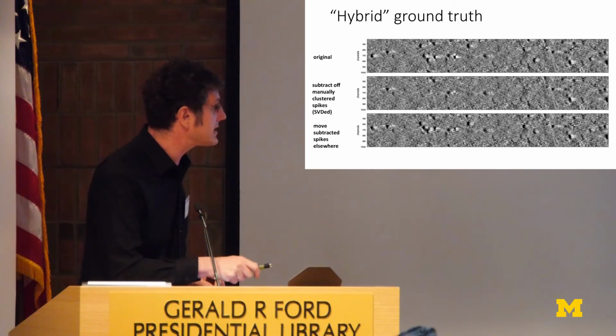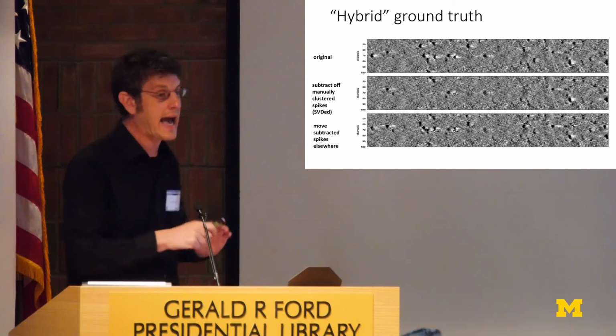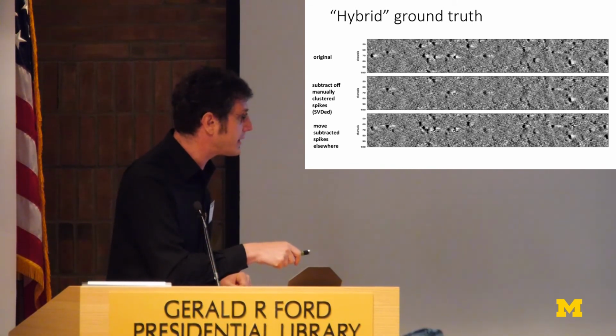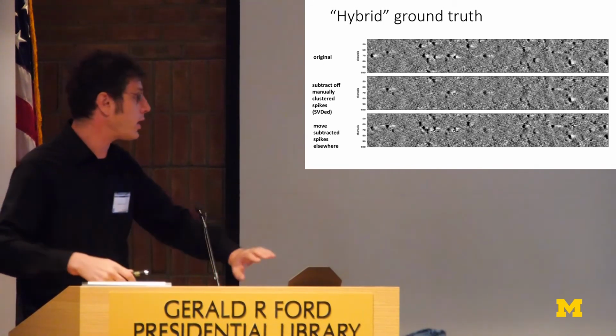But this one is gone. We've subtracted it out. You can't see any remnant of it. If we hadn't done that trick with the noise, you would still be able to see it because it would be exactly flat here. So the signal is gone, but the noise remains.